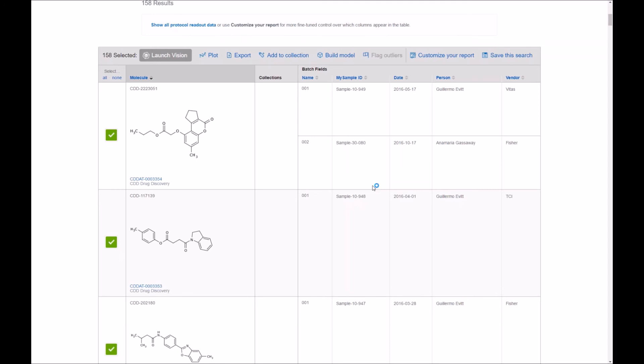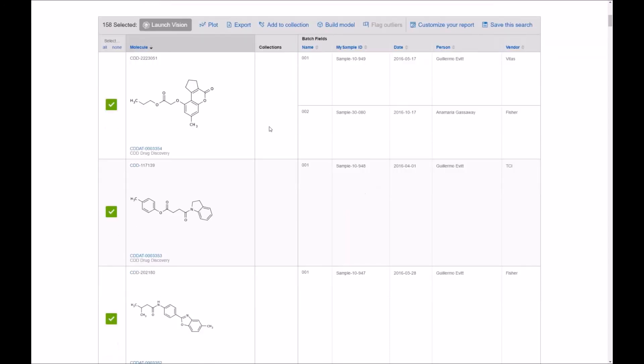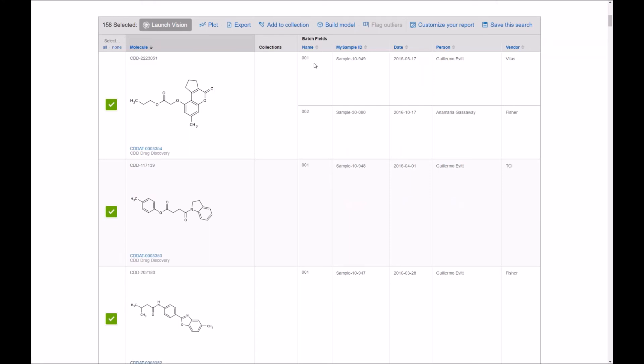And here you go to a simple report that shows you all right great we have 158 new structures, we have certain molecules that contain multiple batches as I alluded to before batch one and batch two, here's the sample IDs that we have, and of course the dates vendors and person. Thank you for viewing this video.